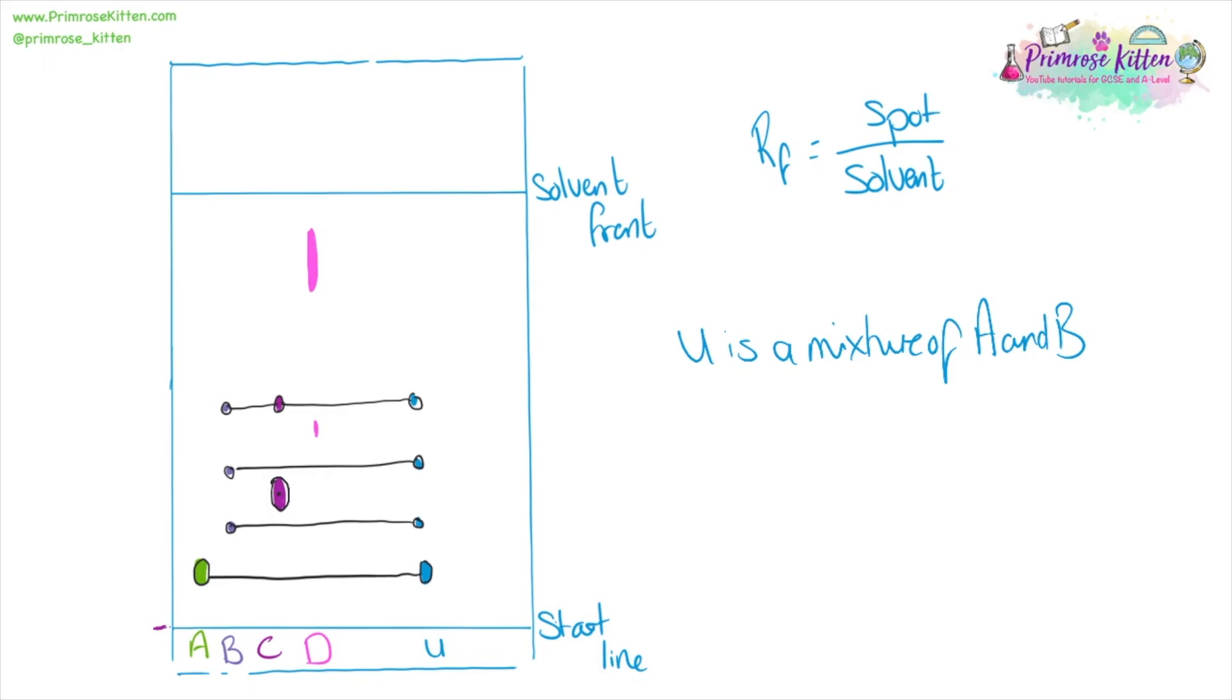So this spot has moved 2.7 centimeters. Now I can measure the distance moved by the solvent front and that has moved 9.1 centimeters.